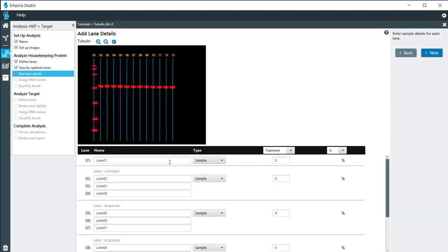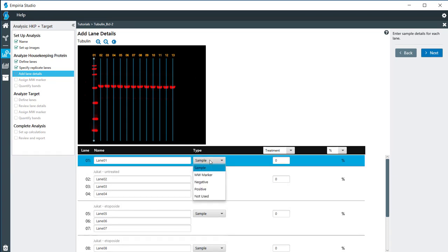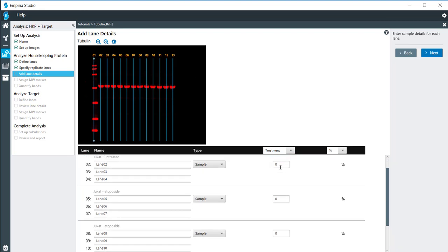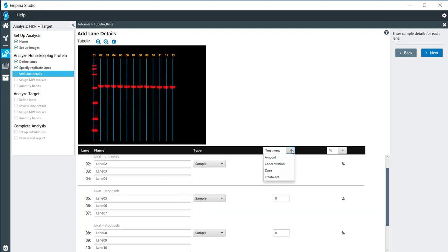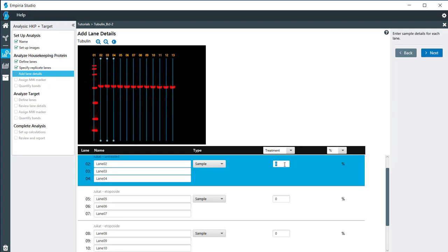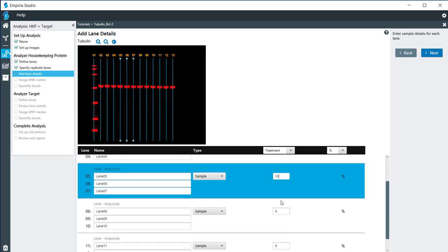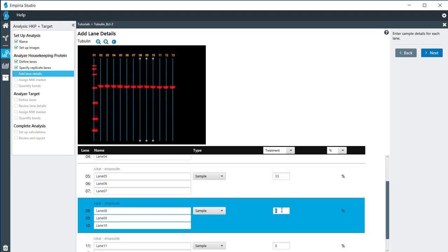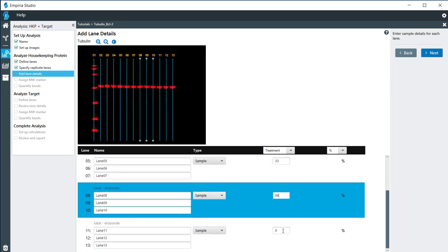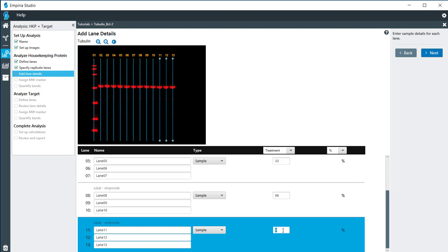My first lane here is the molecular weight marker, so I'm going to label that as the molecular weight. There was no treatment, so I don't need to put anything in that section. You can also add the amount of drug that was used, the concentration, dosage. But for this western, I'm going to use treatments. And so for my untreated lanes, those have zero. I have then 33%, 66%, and 100%.